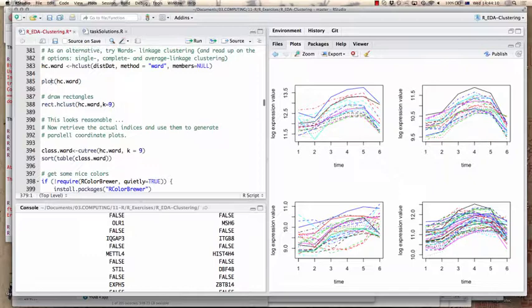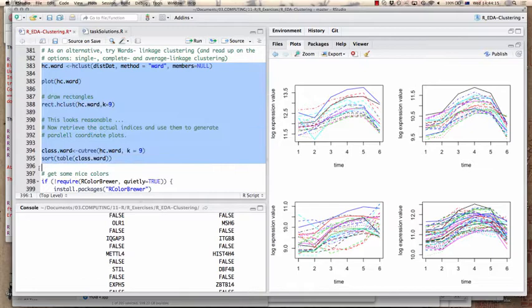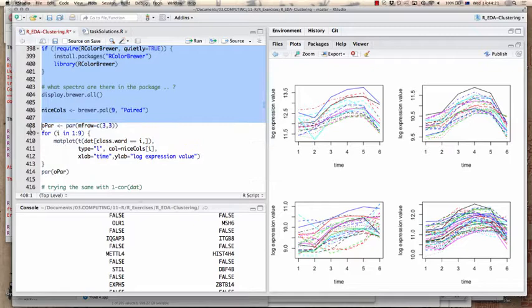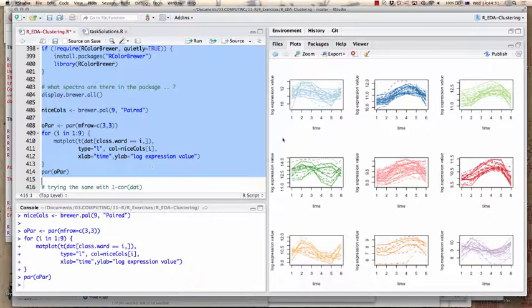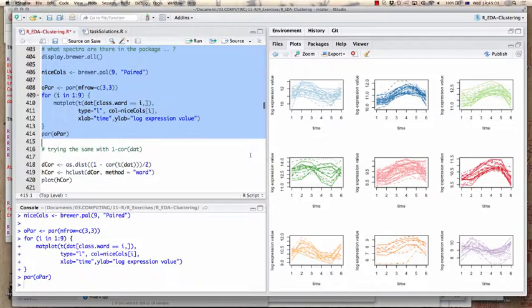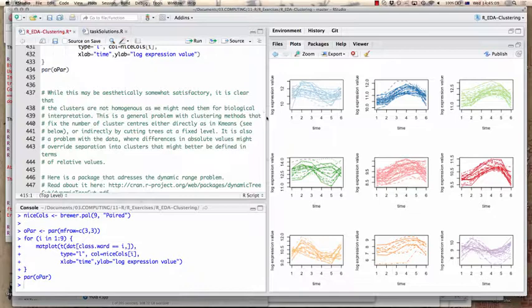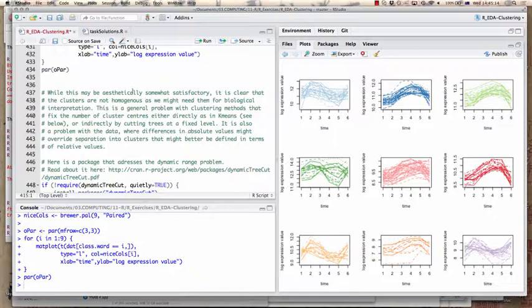As an alternative, we can use a different kind of clustering. Here we get nine clusters in different colors from Ward's linkage clustering. Depending on our viewpoint, we can see the same problem — clusters that look similar to our biological eye but appear sufficiently dissimilar mathematically to be placed in different clusters.